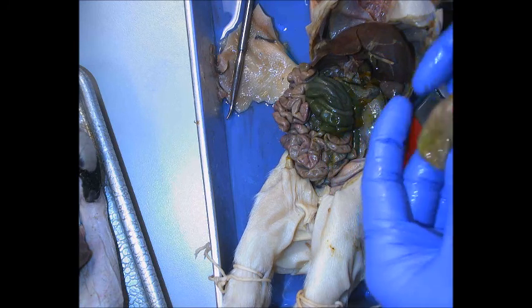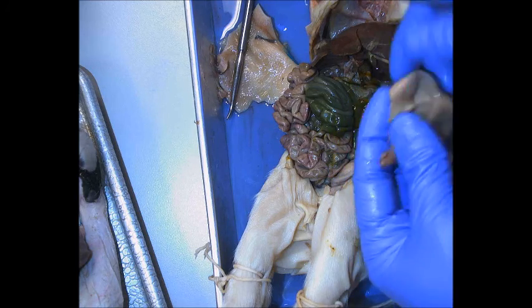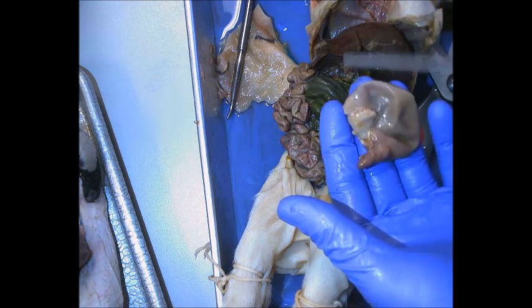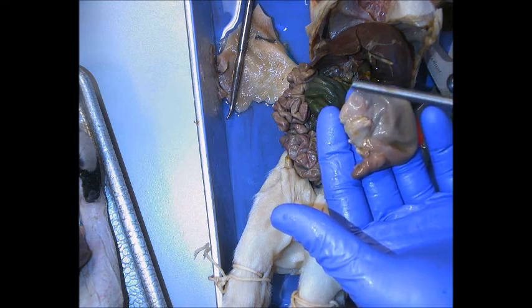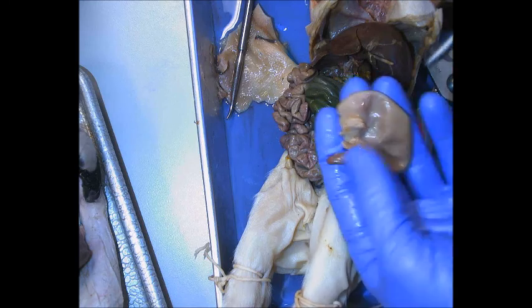It's a little difficult to make out the regions of the stomach, but you can see the cardia and fundus where it comes back up, the body, and then down into the pyloric region, or pylorus.